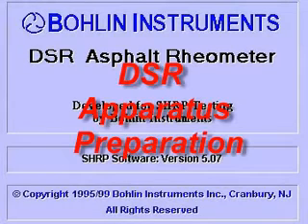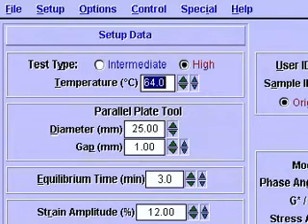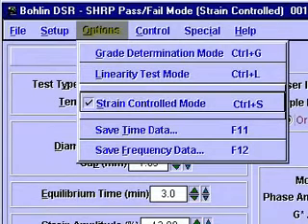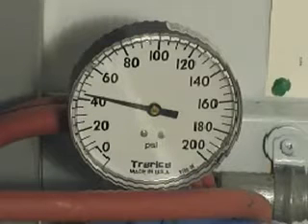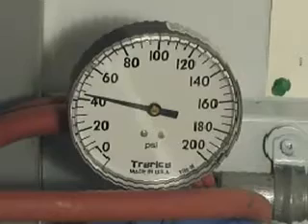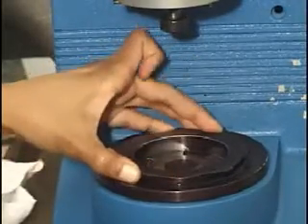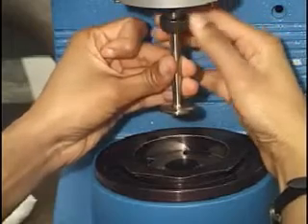DSR Apparatus Preparation. Turn on the DSR and run the DSR program. Set the temperature to the desired test temperature. Set the test control to strain controlled mode if required. For a DSR with an air bearing, turn on the air regulator and set the air pressure to about 43 PSI. Screw the test plate on the fixture and tighten it firmly. Attach the corresponding spindle to the upper shaft.